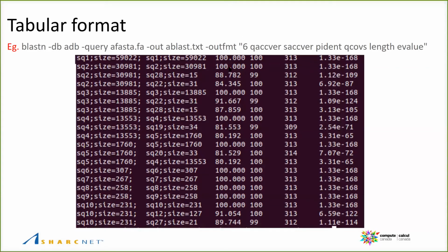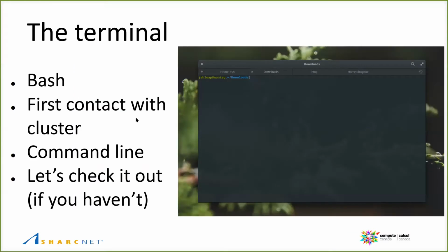Then the third one is going to be the percent identity because I'm telling it here. Then the query coverage, length, etc. If you do not know all the specs of BLAST, you can go to their webpage and you'll see all the possible combinations of these things that you can have.